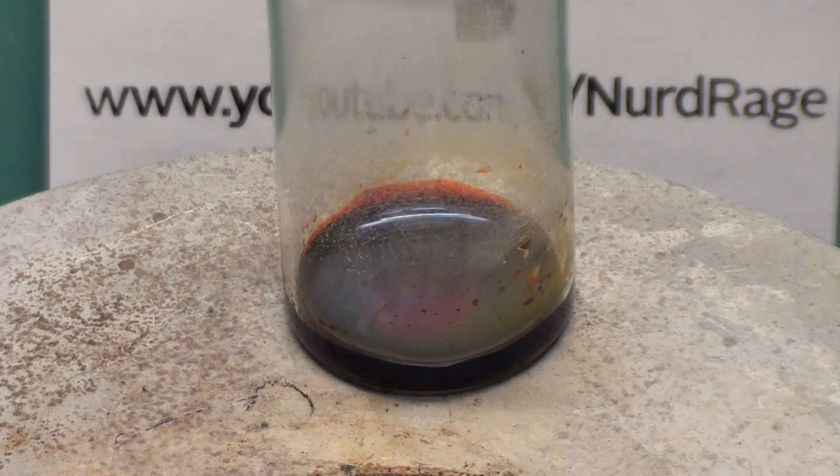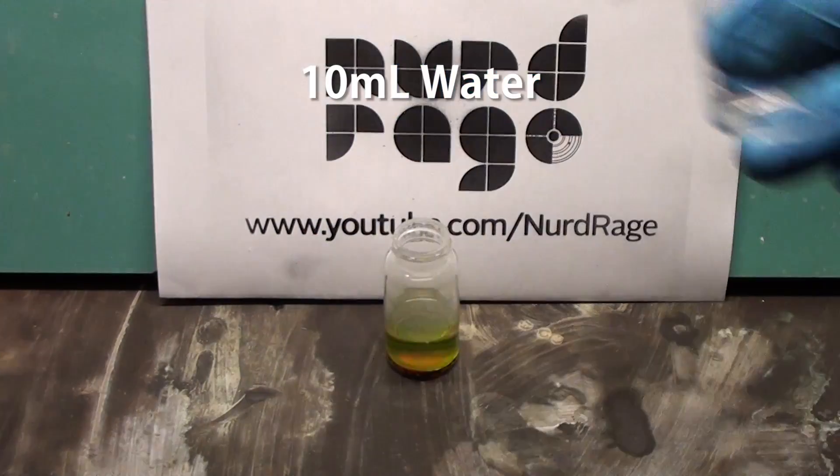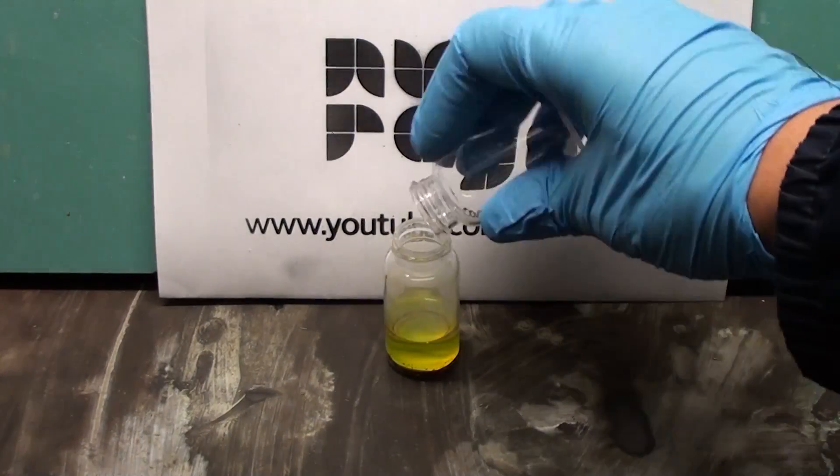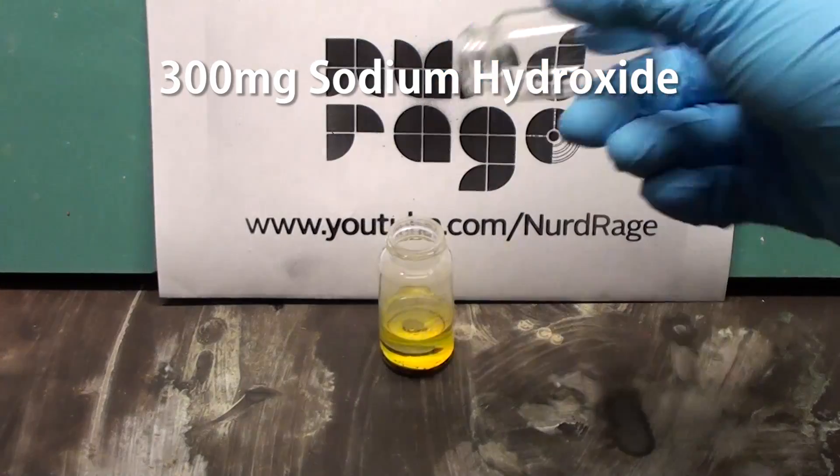When it's done, turn off the heating and let it cool down to room temperature before handling it. Add in 10mL of water. Fluorescein isn't very soluble in water, so we also add in some sodium hydroxide, about 300mg, and shake.